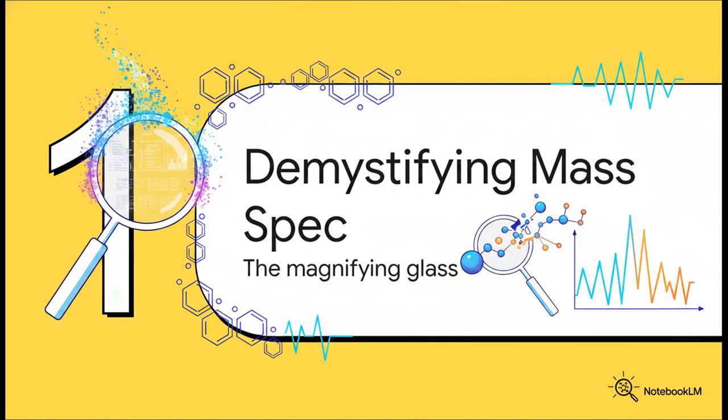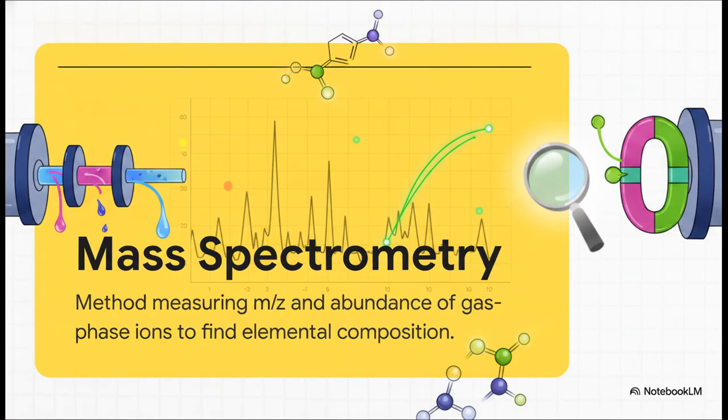Demystifying mass spectrometry, the analytical magnifying glass. To kick things off, let's establish exactly what this technique is. Mass spectrometry is essentially a method that lets us identify the amount and type of chemicals present in a sample. It does this by measuring two fundamental things: the mass-to-charge ratio, which we call m/z, and the abundance of gas phase ions. By plotting that ion signal as a function of the m/z ratio, we get a spectrum. And that spectrum is the absolute key to determining a molecule's elemental composition and figuring out its exact chemical structure.